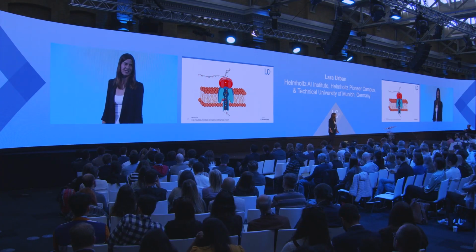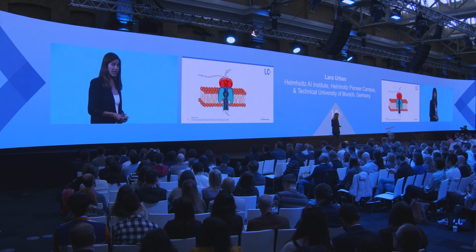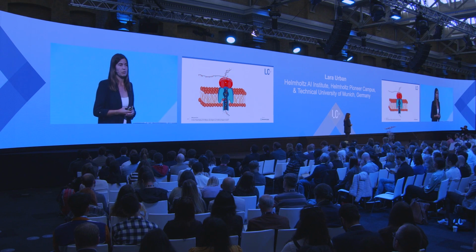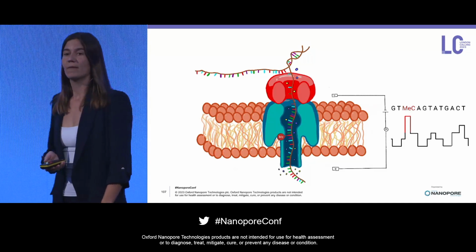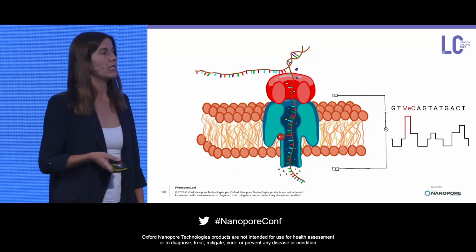And obviously at such a conference like here, I talk about nanopore sequencing when I talk about real-time genomics. But also nanopore sequencing technology is really the only way of conducting real-time genomics nowadays. I'm not going to go into detail about how nanopore sequencing works for an audience like this, but very briefly, what we leverage is that a single-stranded DNA, also RNA, passes through tiny nanopores embedded in a membrane, thereby disrupting an ionic current, and this results in a disruption signal, the so-called squiggle signal that we can then, using bespoke algorithms, base call into DNA sequence.